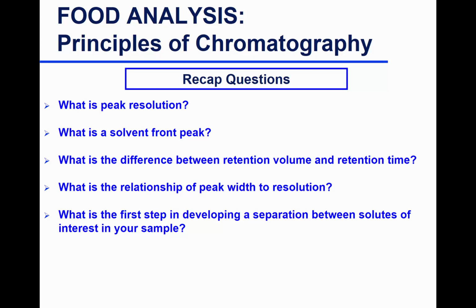What's the relationship of peak width to resolution? Do you get better resolution with wider width, or narrower width? Narrower width is better resolution. Okay. What's the first step in developing a separation between solutes of interest in your sample? What's the very first thing you will do to get a separation?